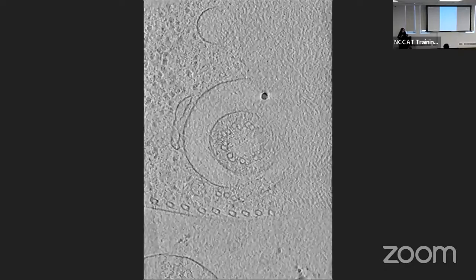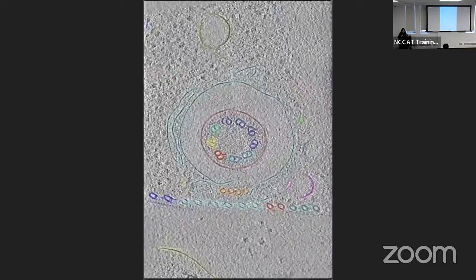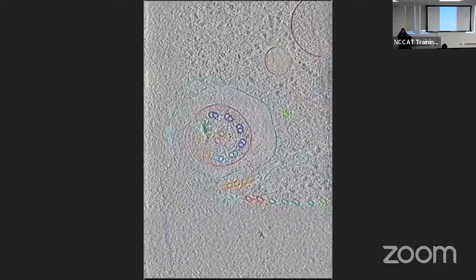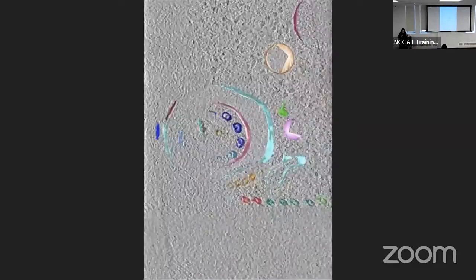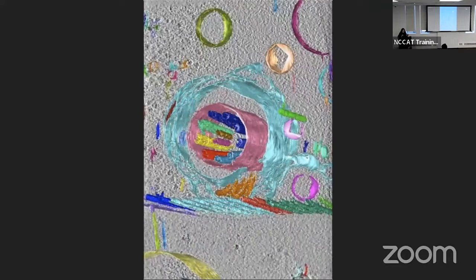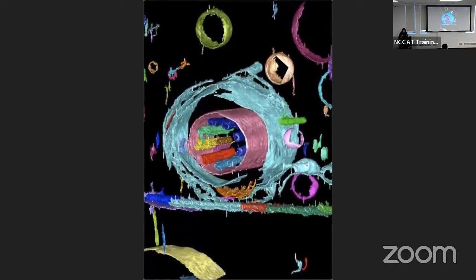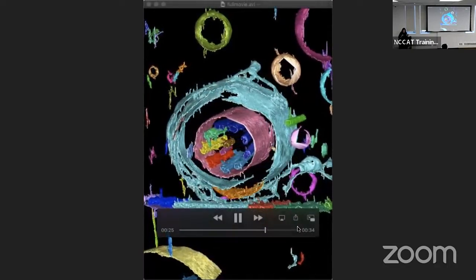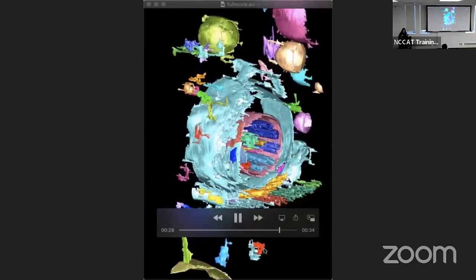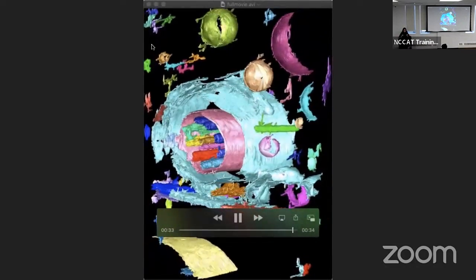So this is a cross-section of a flagella from a trypanosome. We just thought it was super cool. Reza just put it in this TomoSegMemTV thing that auto-segments all of this stuff. And I think it's pretty cool because you can see all the membranes and the signaling and the microtubules that are in there. So I thought that was pretty sweet. It's just kind of a cool end video. And this was obviously from a lamella from a waffle grid, which is the only reason I would include it.